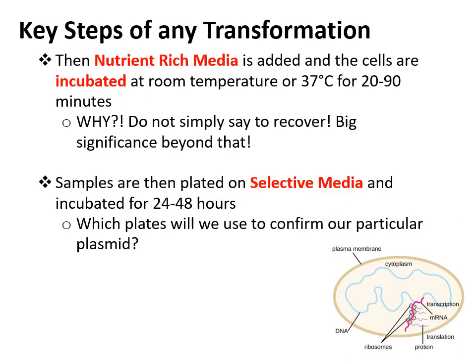After that, at this point, you hope that you now have the plasmid DNA nice and safely in the bacteria. You then incubate those cells in nutrient-rich media, which we call LB. So let me grab the pen and write nutrient-rich media. What we use is LB. That stands for Luria Bertani. Okay, you don't have to memorize that, but just so you know, LB stands for Luria Bertani. It's a type of broth or agar plate, and it basically has all of the nutrients and important things for bacteria to survive and replicate.